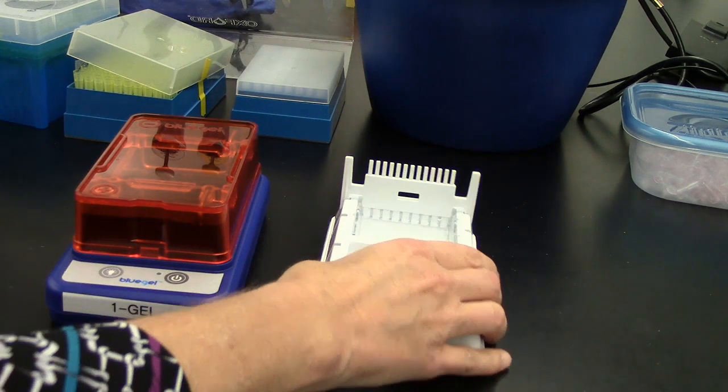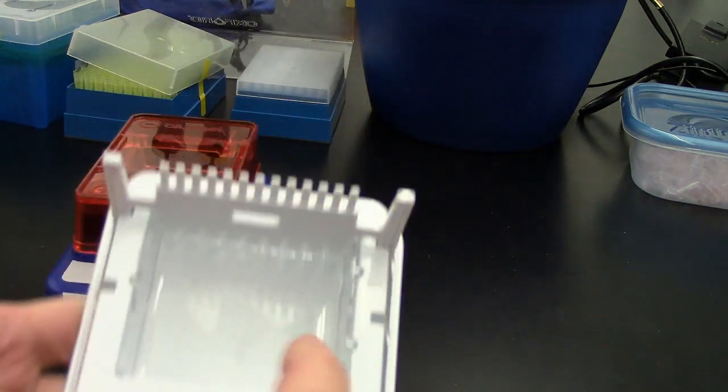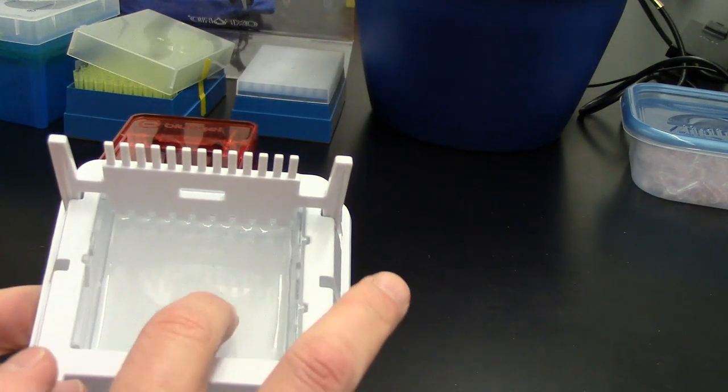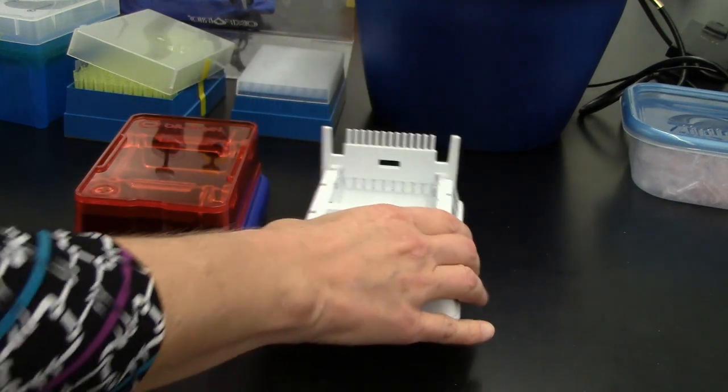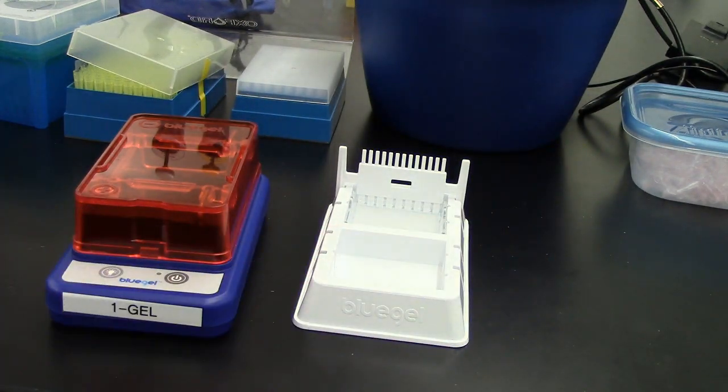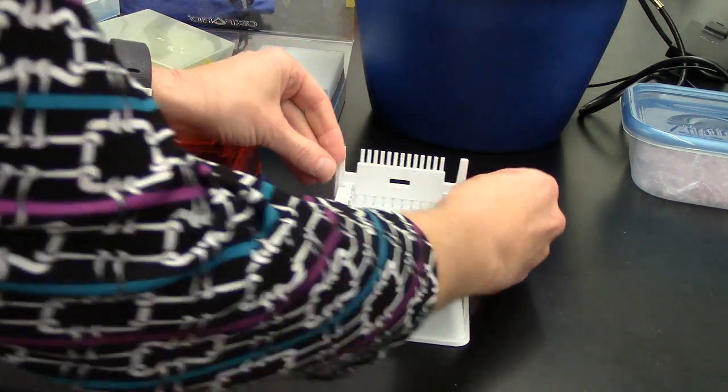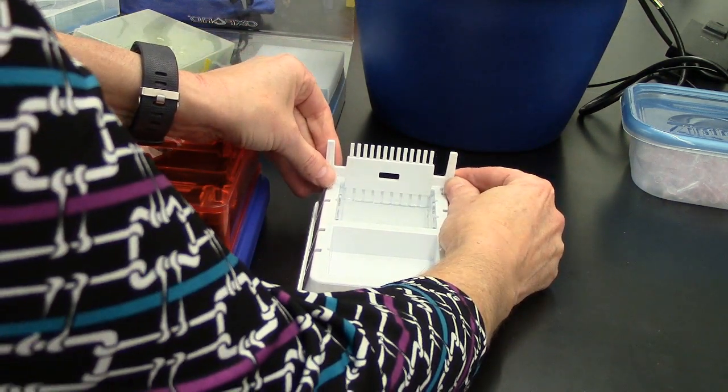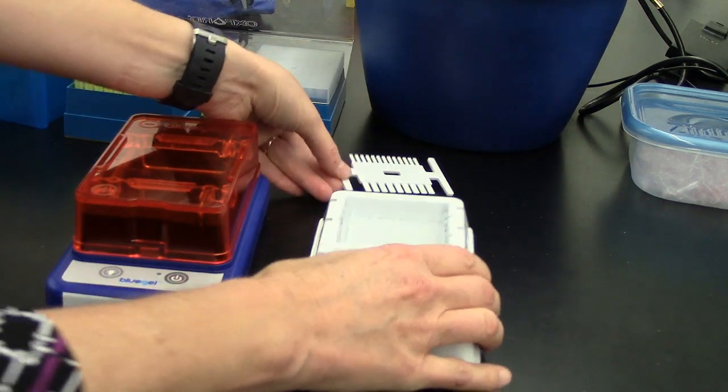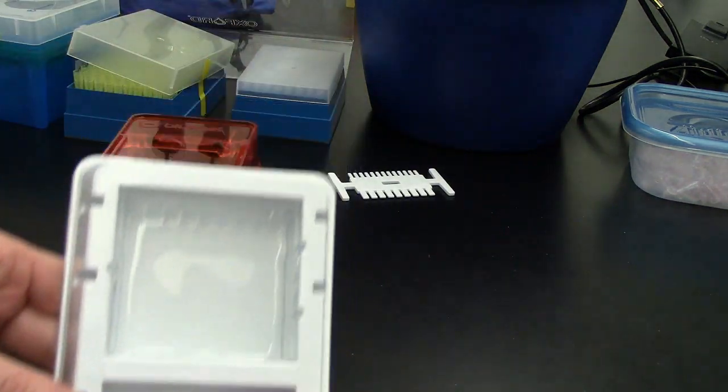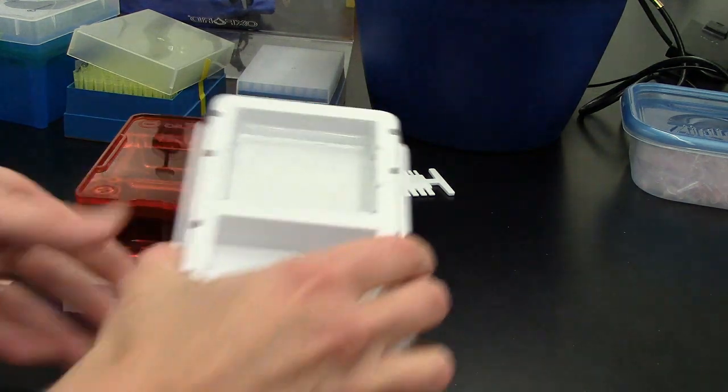Once your gel is solidified, it should feel nice and solid. We need to put it into the electrophoresis chamber. First, remove the comb by lifting straight up and remove the comb. You should see little wells where the comb used to be.